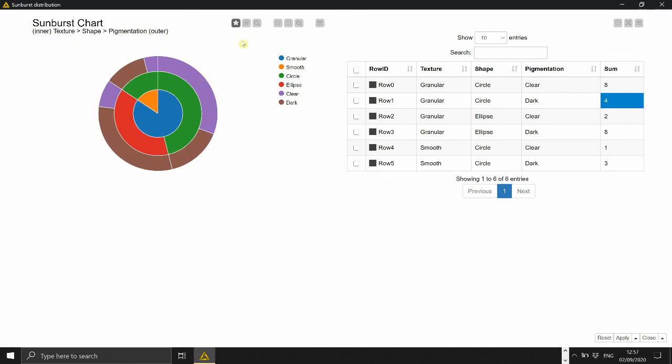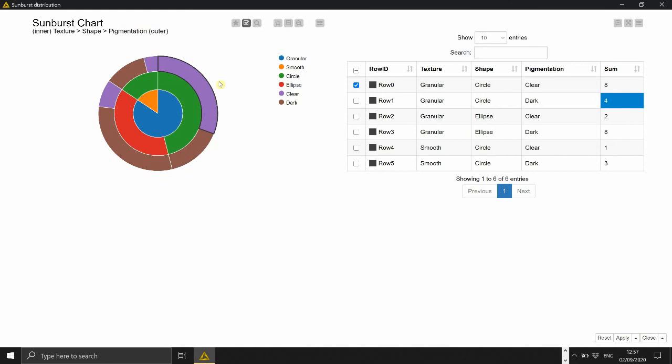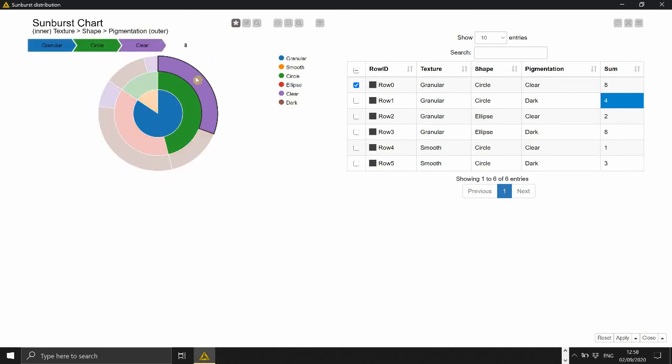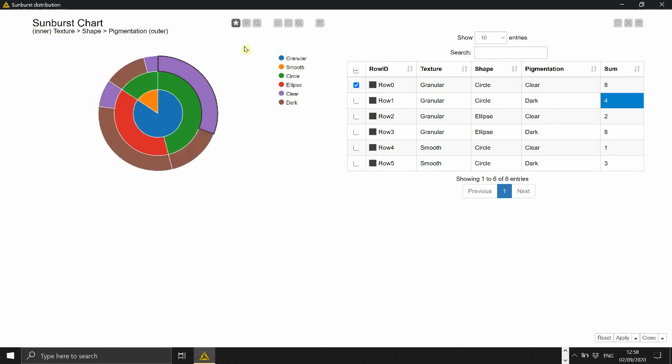Second option is selecting so you can select some fraction and actually it's interactive so you can see it's interactive with the table you can see that this particular section actually corresponds to the combination of feature or embryos with granular texture circular shape and clear pigmentation which is indeed the first row. Which has eight embryos.